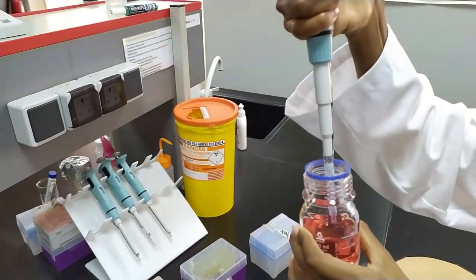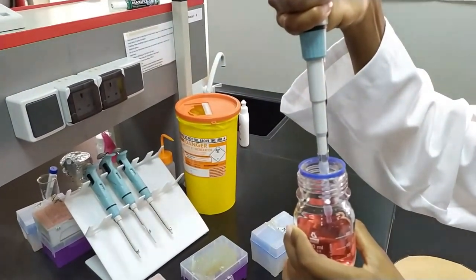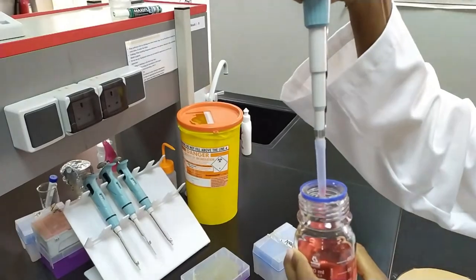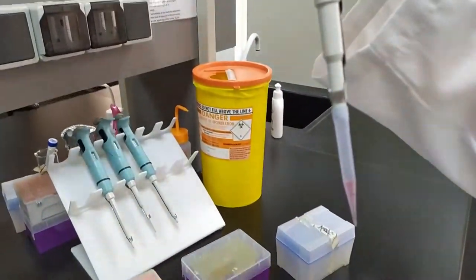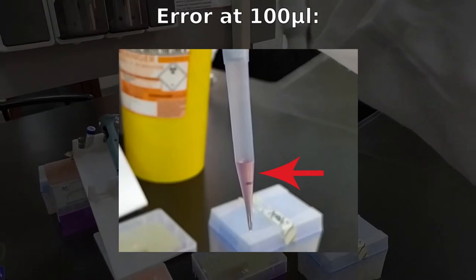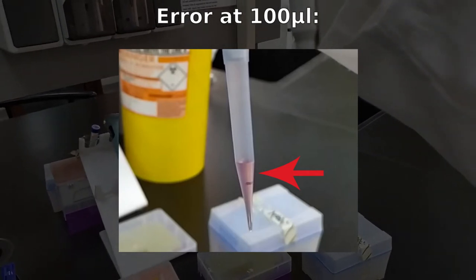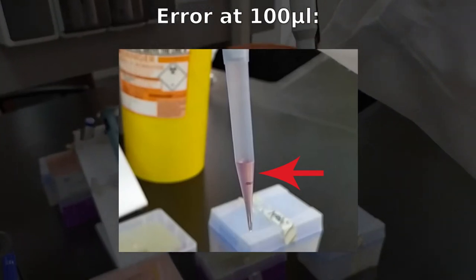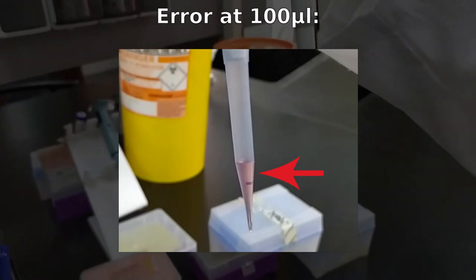Here, Oconia is going to press the plunger all the way to the second stop and then slowly release it to take up the liquid to see how much extra liquid there is in the tip. Clearly, poor technique will yield poor results.